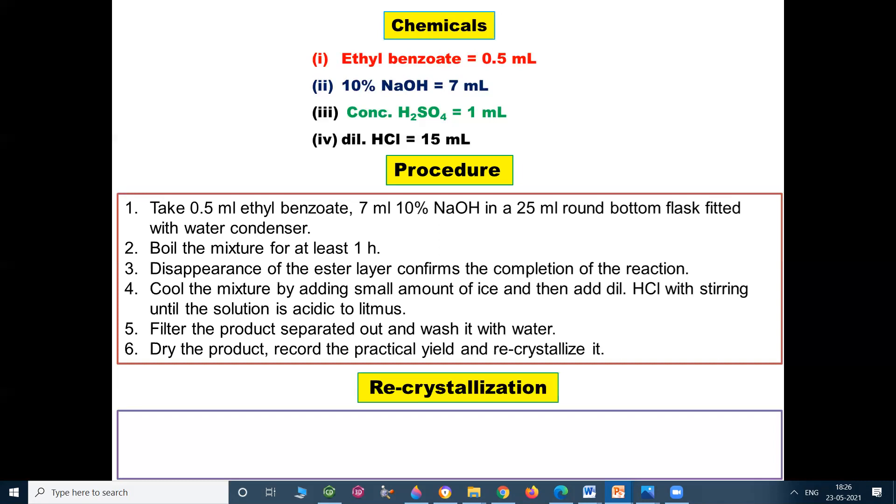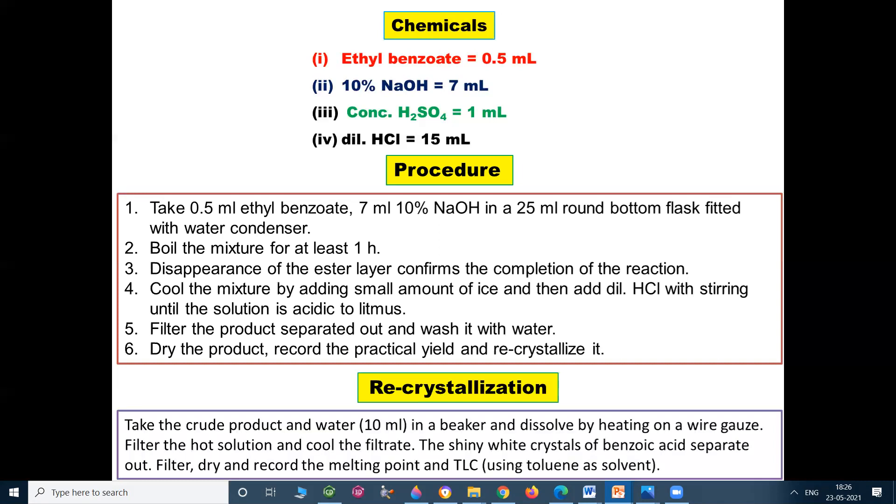Recrystallization: Take the crude product and water 10 ml in a beaker and dissolve by heating on wire gauze. Filter the hot solution and cool the filtrate. The shiny white crystals of benzoic acid separate out. Filter, dry and record the melting point and TLC using toluene as solvent.